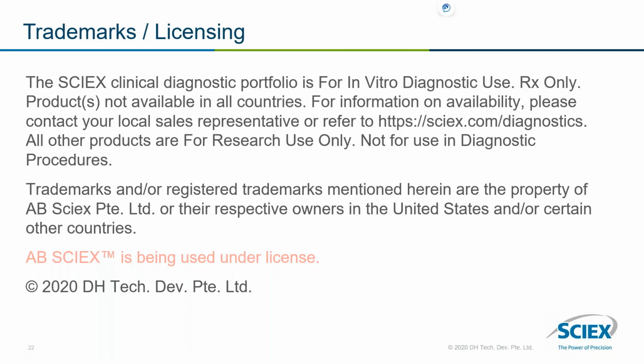Actually, we have included units of measure in the data model that we've used, and those are using standard terms. Those units of measure are visible in ADF Explorer. I didn't include that in the screenshot that I showed, but the units are there as well. Wonderful. Thank you.